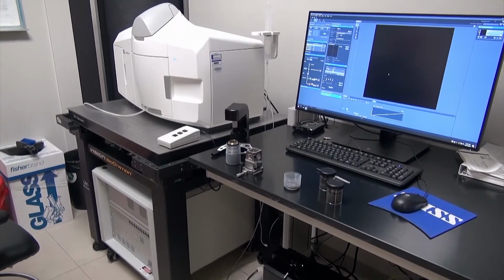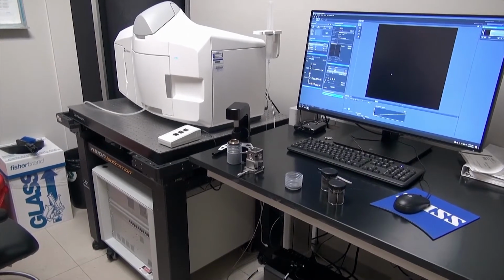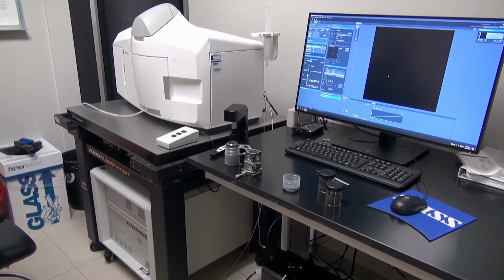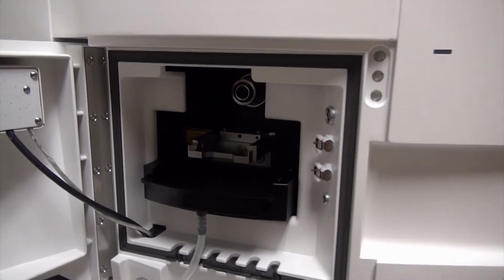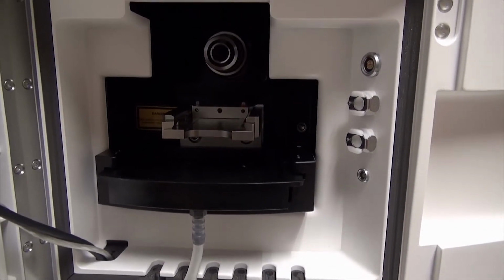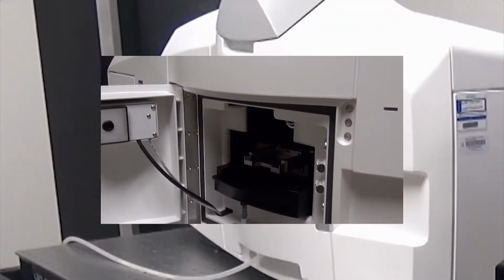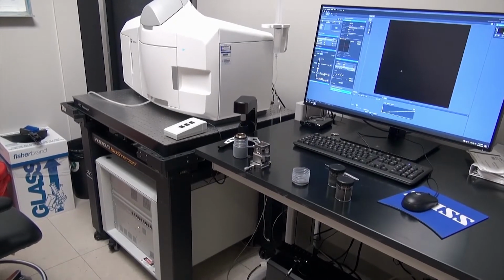The special stage on this microscope allows X, Y, Z and rotational control, and we have objectives that are both dry and also water immersion objectives, which can be then used for live imaging of samples. Besides live samples, we can also use relatively large, clear to transparent samples.